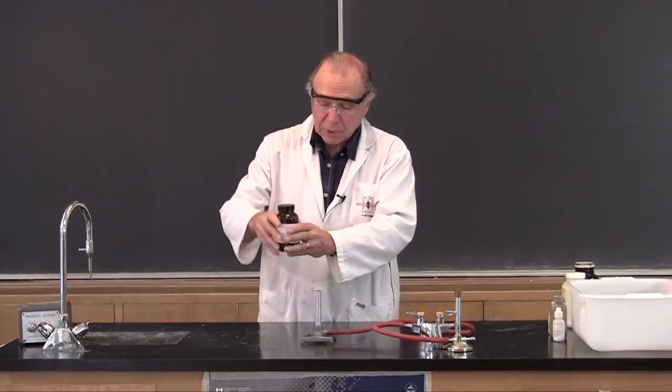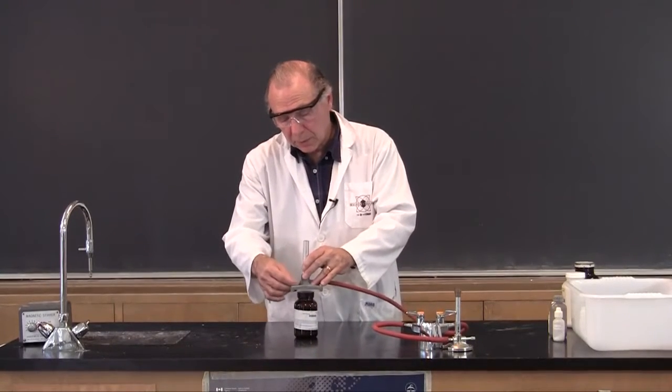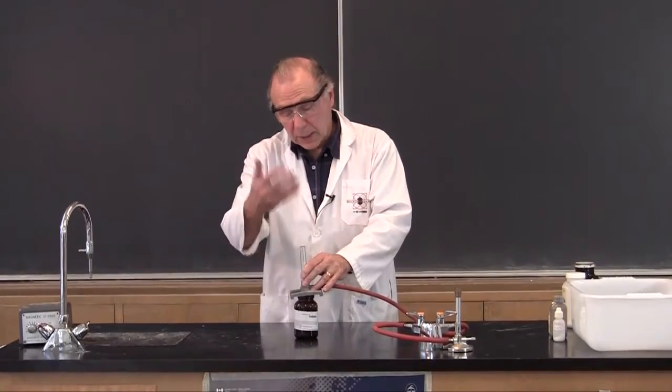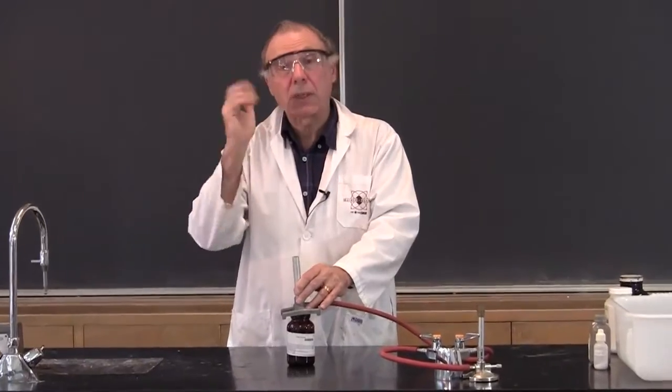I'm going to open up the top, and when the burner is on, put it on top here with the lever open. That's going to draw the particles up into the flame, and it will excite the particles, and we'll see the color.